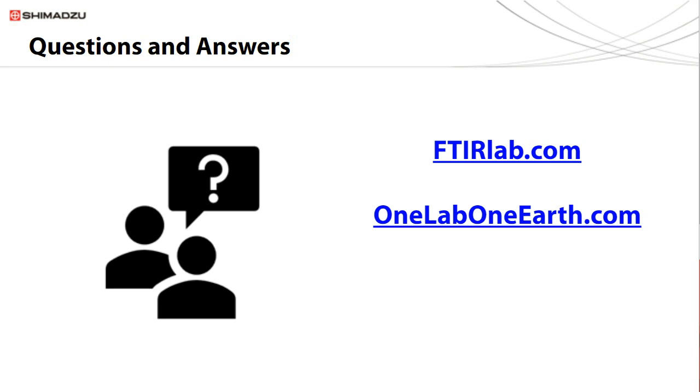Sure. So what we did as we were planning this experiment was basically say to ourselves that if the signal is real, averaging more of them should increase the signal to noise ratio. Again, this is true only if the signal is real. So we first used a 5 micron size particle and averaged different numbers of scans. The signal to noise ratio, with the increase in number of scans, stayed pretty flat, clearly suggesting that all or almost all of the data we were getting was noise, or there was no significant, real signal.